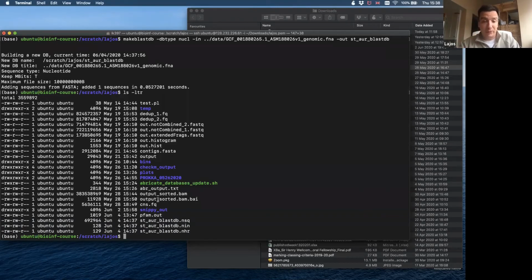I think maybe the easiest search is just to simply look for the contigs FASTA. There will be quite a lot. Maybe we can just make a smaller piece from the contigs FASTA.